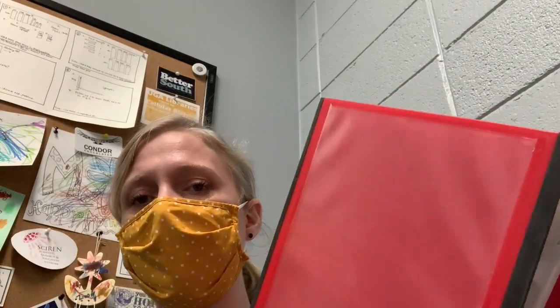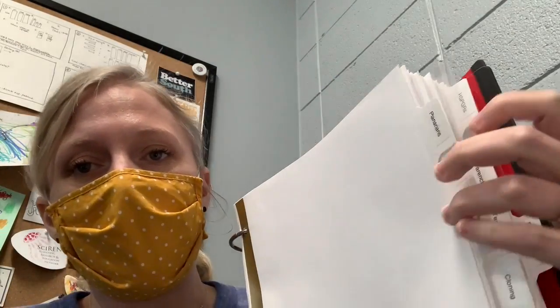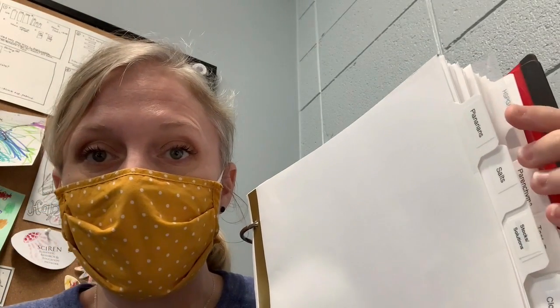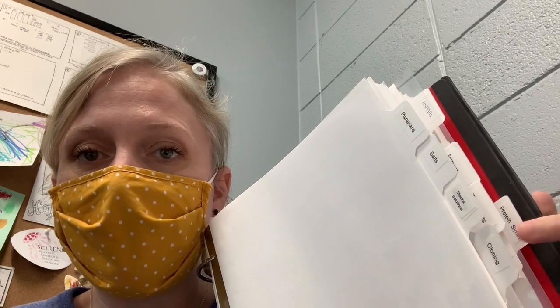So we keep our lab notebooks in binders that look like this. We have tabbed pages. So I like to have something that says planarian. So that might be my logs of my planarian feedings. I might have, what else do I have? Stocks. Every time I make a stock, I put it in that folder. If I'm doing cloning, I put it in that tab, and so on.